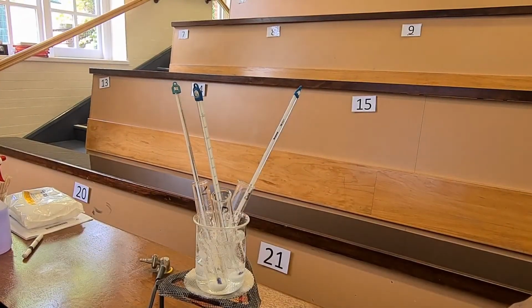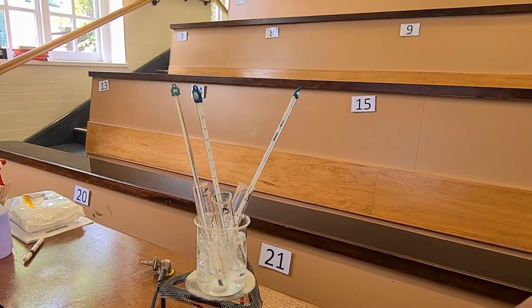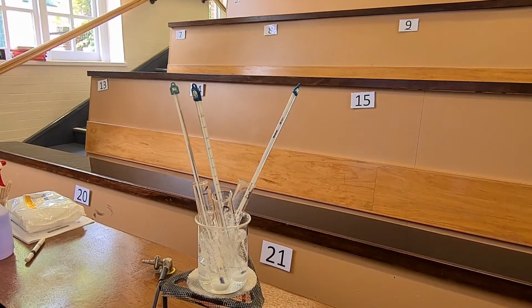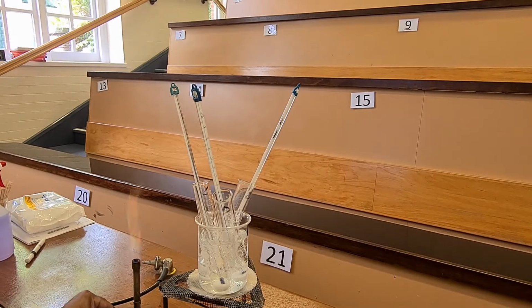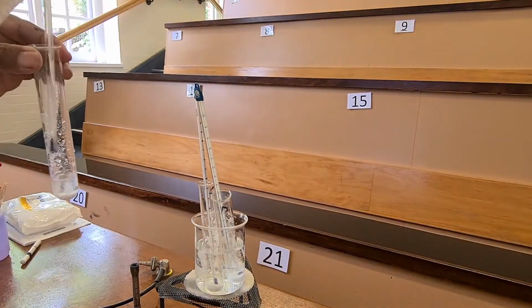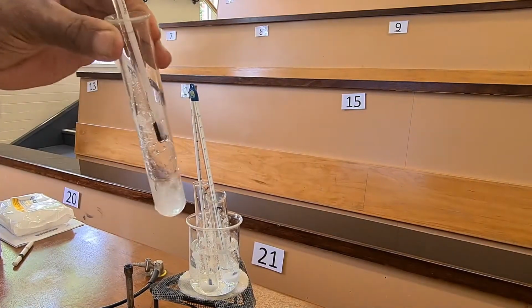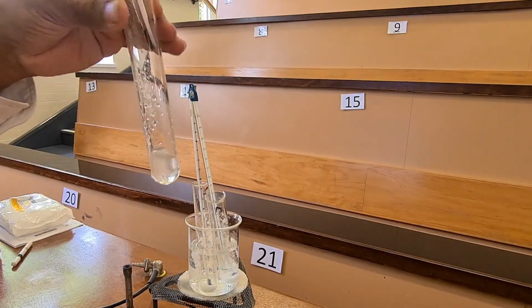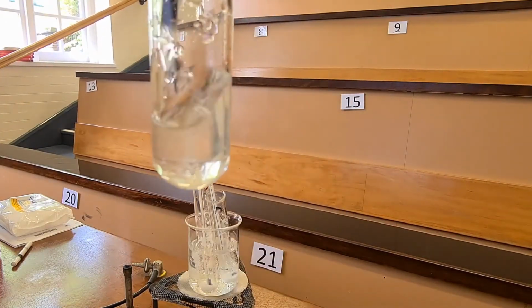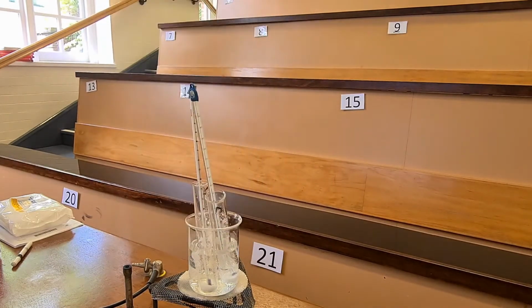And I think that in test tube A, it's dissolved. Now, test tube B. B's that one. There's some solid down the side which I'm trying to push down. Perhaps you can see a little bit more closely that all of B has dissolved. That's B.